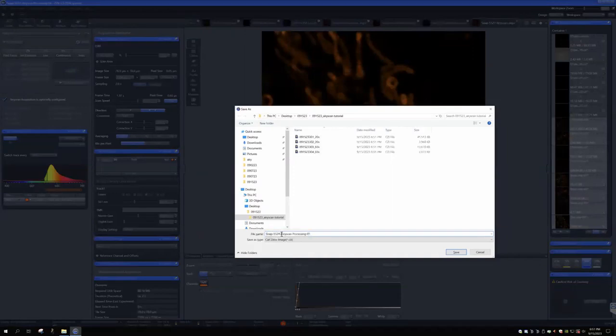Here you can notice that every processed file will have a new name at the bottom, Airyscan processed. So right now I'm going to just use 23301. This is the name of that 20x objective. I'll use the same name here, but we'll keep the Airyscan processed at the bottom.